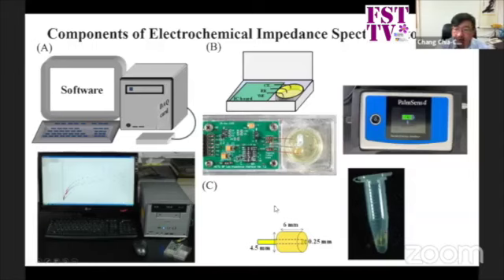But for the experiment, we may use a lot of electrodes because we need to gather a lot of data. In general, each figure may need 60 to 100 points. So if we polish the surface each time, it is very time consuming and not efficient.